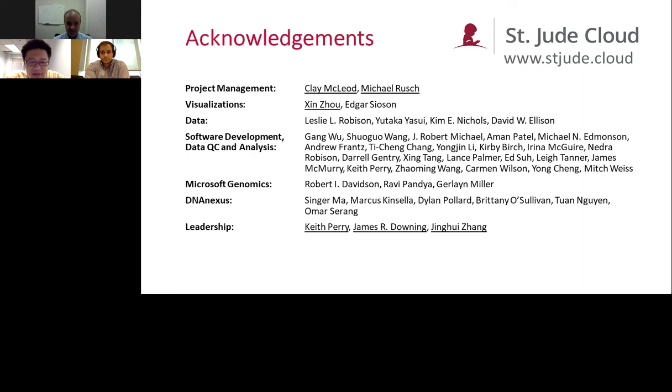All right. Then we have another question of how can I learn to use the St. Jude tools? That's a good question. I'll take this one too, Scott, if you don't mind. When me and my team are working with the biologists here and we're developing these tools and optimizing them, one of the things that we place a lot of emphasis on is making sure that it's very clear how to run them. What the results are spitting out is very clear because we've had a lot of experience with bioinformatics tools being black box tools.